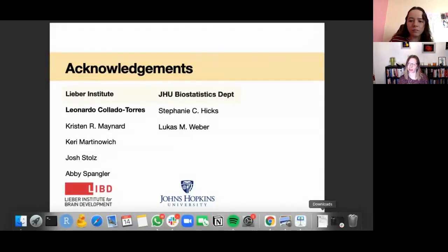We have one more question from Friederike, who was asking, you mentioned that this was for a single sample. How would you go about with multiple samples? Okay, yeah. So Elena and Dario, we met, and they are working on making this VisiumExperiment object for multiple samples, including these difficulties with having multiple scale factors. So yeah, they are planning to make this object available to include multiple samples. Work in progress. Okay, thank you very much.